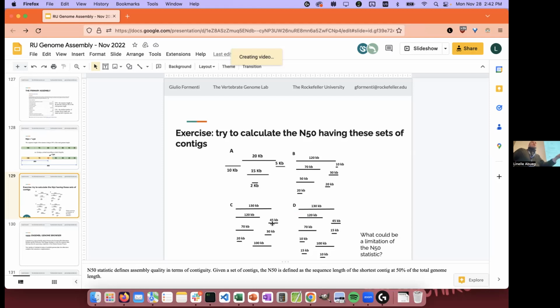Whereas if you were to use the average, if you have small fragments of one base pair and you start to do the average of all your sequencing, basically you get very, very poor results, and you start to get confused about what is exactly the status of your library.